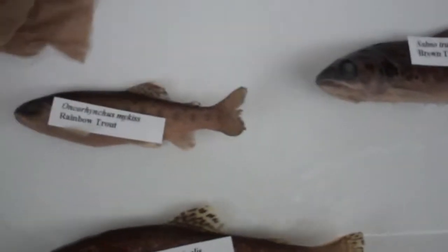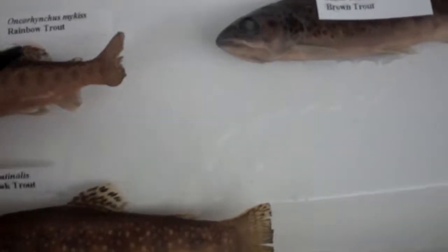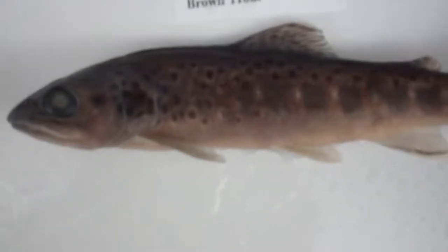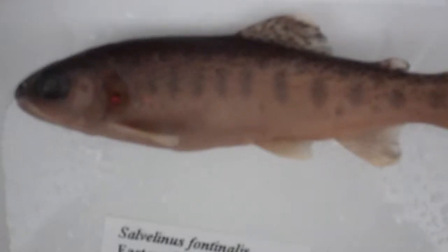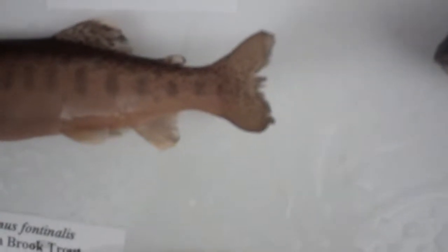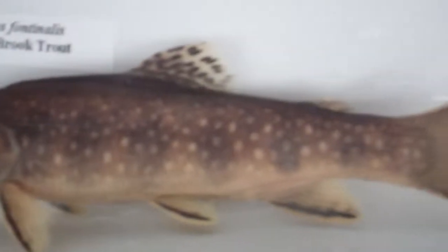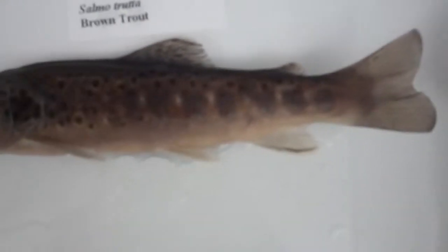Family Salmonidae. The differences here are the spots. Brown trout has dark spots on a light background. Rainbow has tiny dark spots, and there are spots on the caudal fin. Eastern brook trout has light spots, with a little bit on the caudal fin. No spots on the caudal fin of the brown trout.